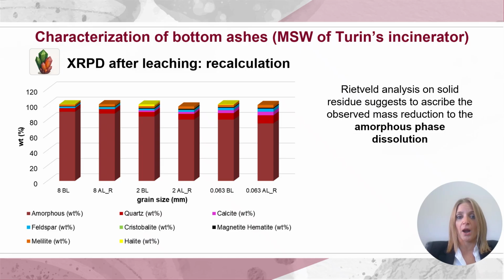Interestingly, in the coarser fraction above 1 millimeter, this phase appears slightly less reactive, likely due to the presence of bottle glass fragments, observed also macroscopically, which are more resistant to dissolution compared to the finer amorphous material.